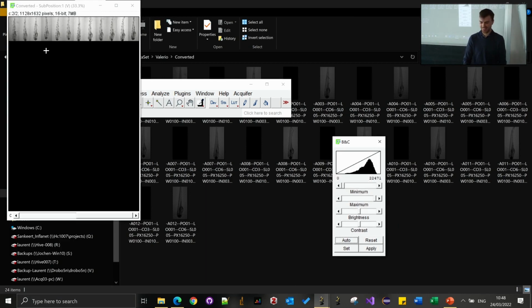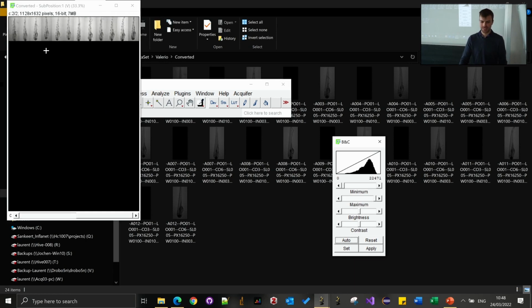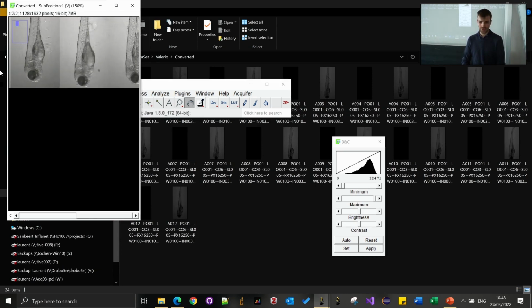Nice, that's cool. So obviously here you could check the cropping. And then you can pan with this hand icon, and I think they also tell you that you can press the space bar, exactly. Okay, in my case, it's not working. I see.